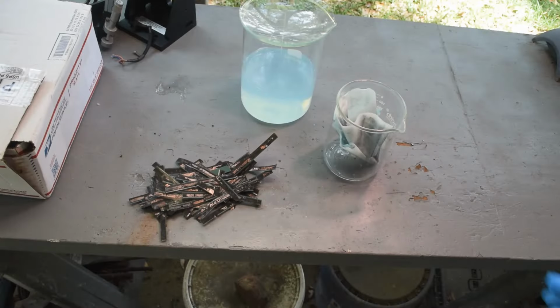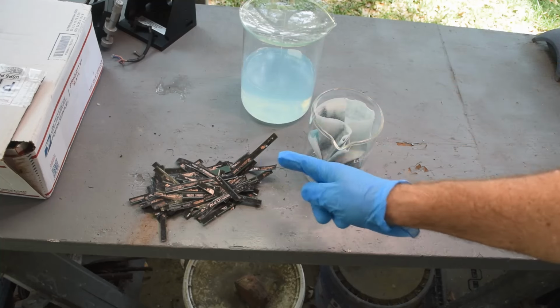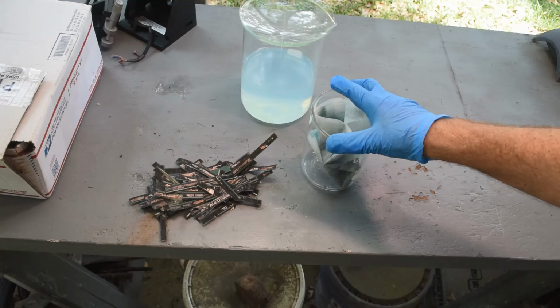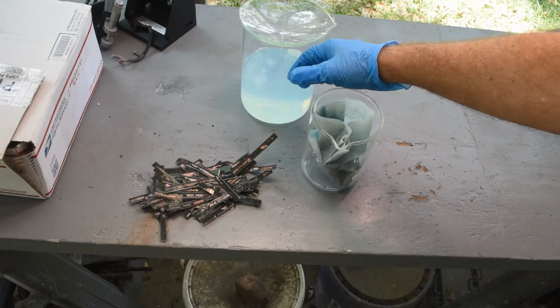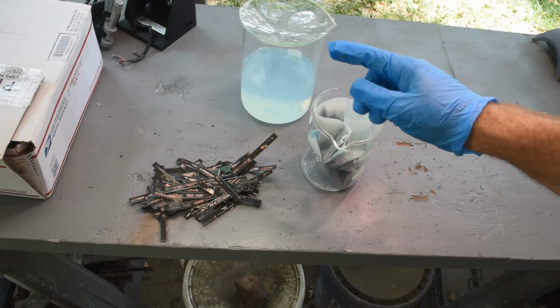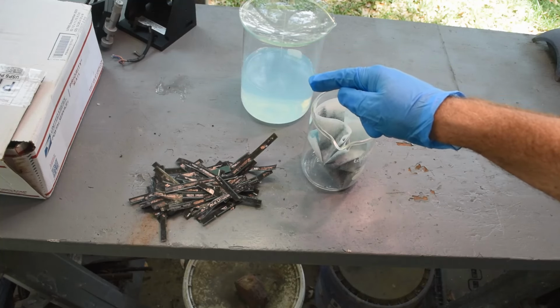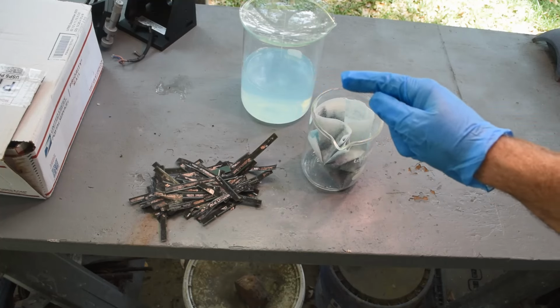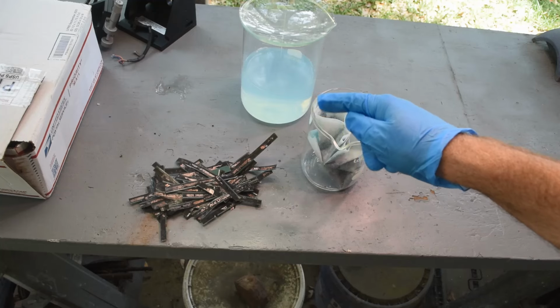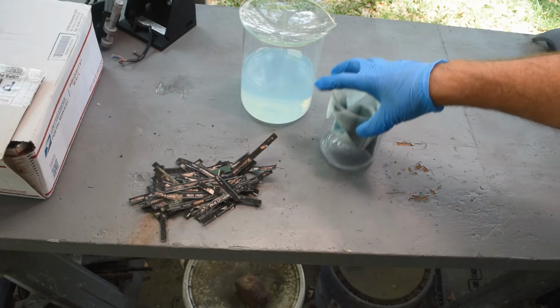Alrighty, so here are our two filters that contain all the palladium from what was originally 100 grams of the stuff that Joven sent me. I don't know if I mentioned earlier, this liquid over here, I'm just going to put in my waste bucket. I don't think there's enough trace palladium in it to bother putting it in my stock pot. Besides, my stock pot's pretty full right now. This has been diluted a lot with rinse water, and there wasn't much in straight liquid, so probably not worth putting in a stock pot.